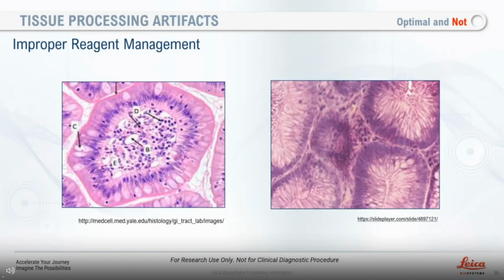I think with the second part too, when it's on the processor and you've done your validations, you have fresh reagents. I think again, it's key to the maintenance. Thank you. Thank you for that question. Next question. How do you overcome zonal fixation?